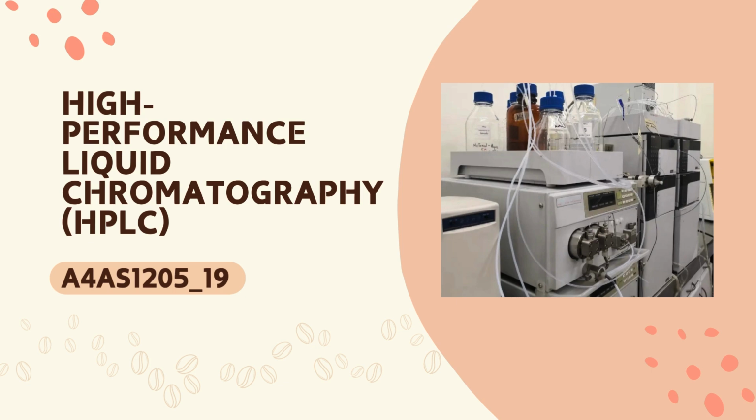In this presentation, we will delve into one of the most powerful and versatile tools in modern analytical chemistry, high-performance liquid chromatography, or simplified HPLC. HPLC has become a cornerstone in various fields, from pharmaceuticals and food safety to environmental science and biotechnology. Whether it's ensuring the purity of a new drug, detecting contaminants in water, or analyzing complex mixtures, HPLC has revolutionized how we approach chemical analysis.